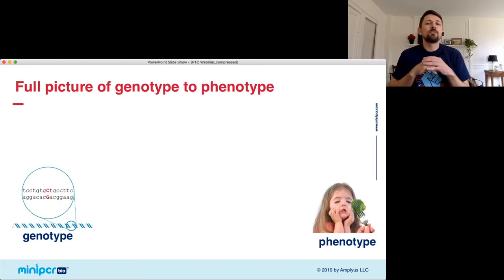So in this lab, what's so fun about this lab is that we can get this full picture of genotype to phenotype. I've already taken my phenotype, right? I'm a taster. But now for this lab, we actually know the genotypes. And so we're going to be able to figure out exactly what my genotype is.